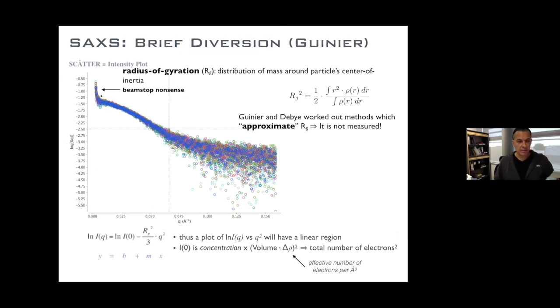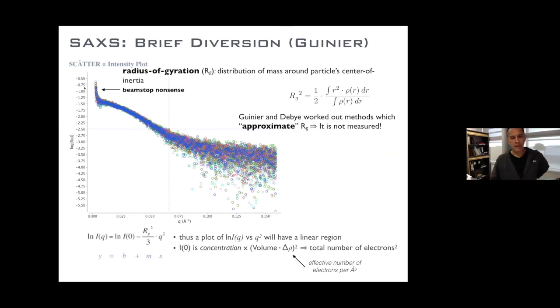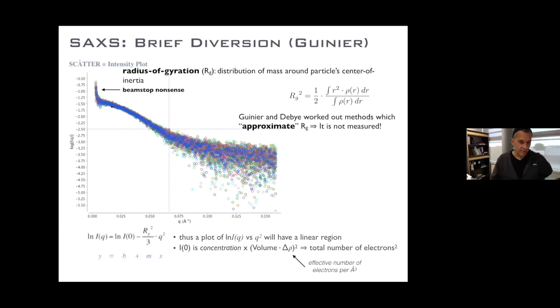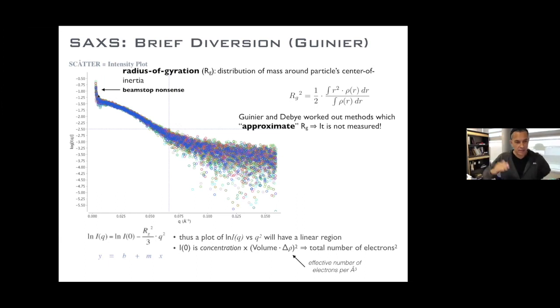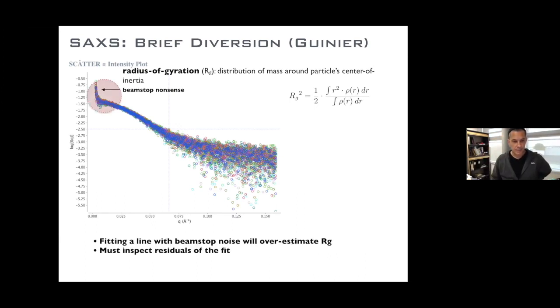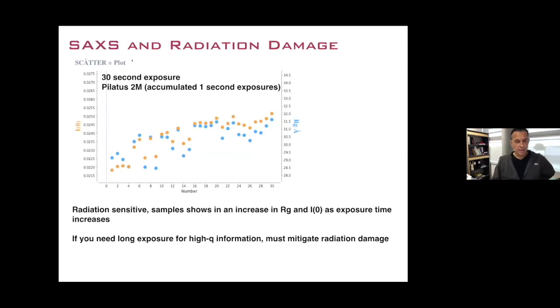Here's a good example — a BSA difference curve showing flaring around the beam stop caused by slow movement of the beam stop during measurement. What you'd have to do in manual processing is cut back that part of the data. You still have enough information around the Guinier region to give meaningful information, but the caveat is that the uplift there is also uplifting your Guinier region slightly, so you may overestimate Rg.